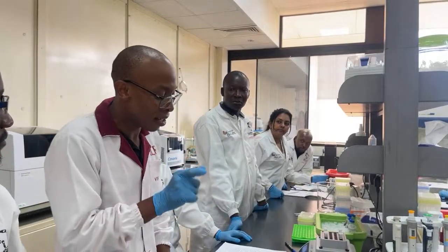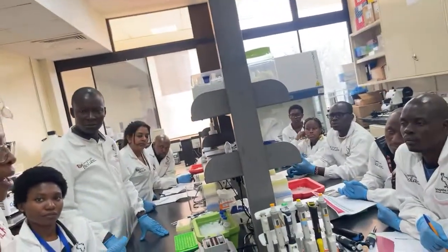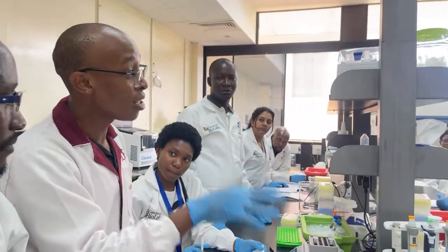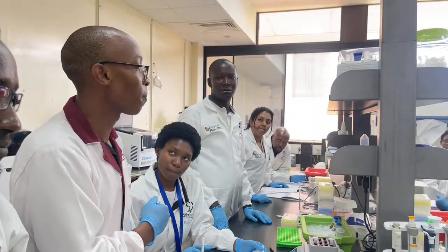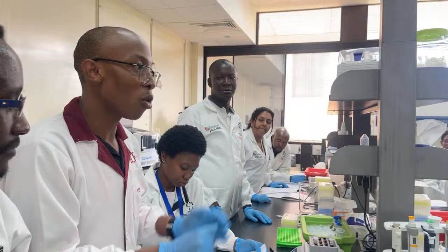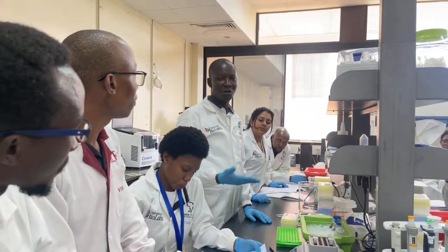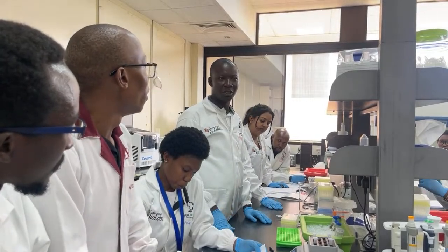remember, what counts most in NGS, especially when it comes to loading, is the specific size spread. The stuff that you load in there is very expensive, so you don't want to take a chance with agarose gel, whether it's short reads or long reads. Unless one is doing maybe a quality check.